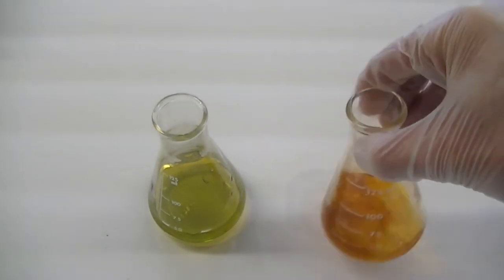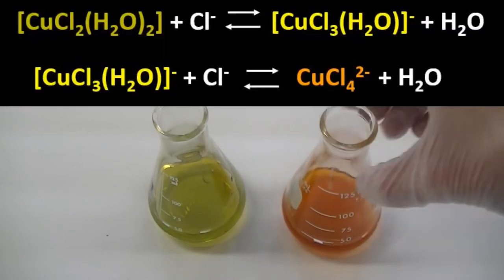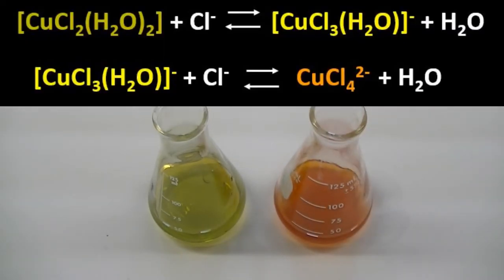Notice the shift to an orange color. This color change can be explained by noting that in the presence of very high concentrations of chloride ion, the yellow-green dichloro-copper species reacts to form a yellow trichloro-copper species.